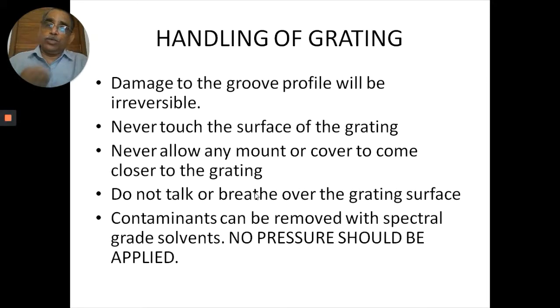Once you breathe on it, you will see moisture condensation that will also spoil it, and organic matter falling on it. So you have to be very cautious when you are handling the grating. When you are mounting it or removing it, you have to wear finger cots or full gloves. You have to really make sure you put on a mask. All those precautions you should take.